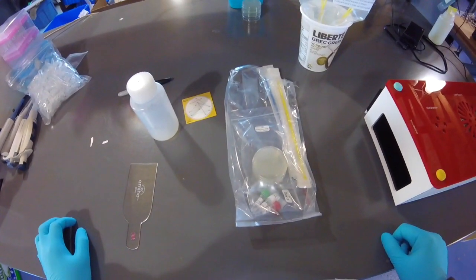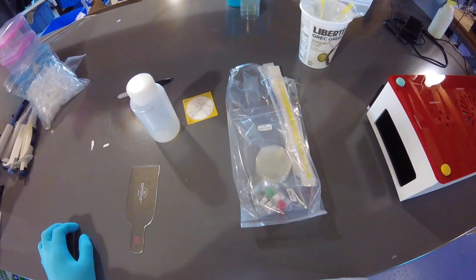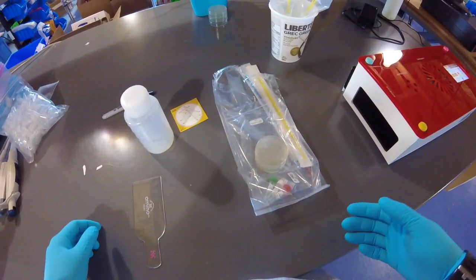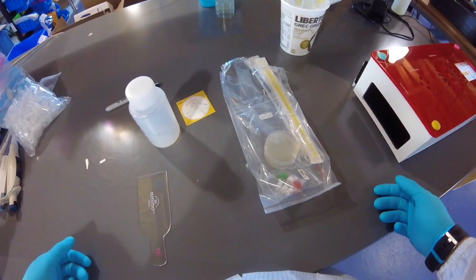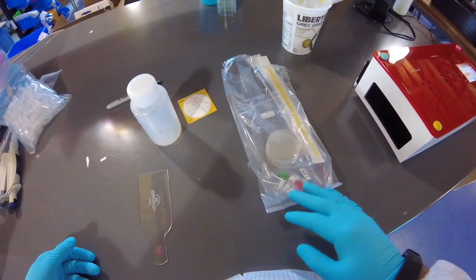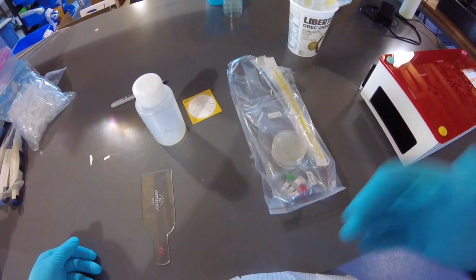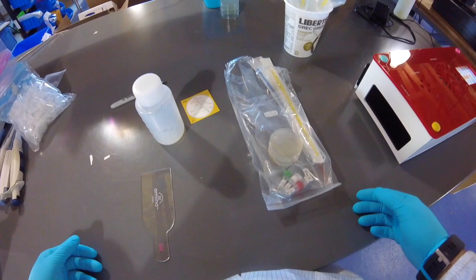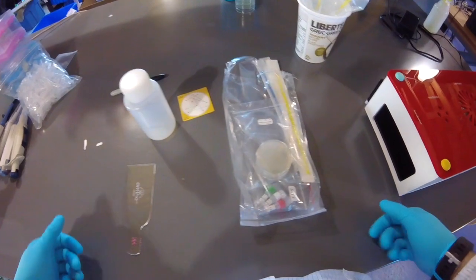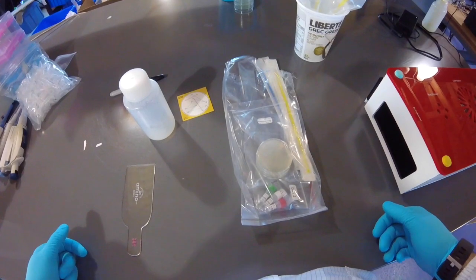Hello, we're now at day 2, and the main goal of day 2 is to do the actual transformation or genetic engineering step, where we're going to collect some of our blank cells that we streaked out yesterday, and through a little bit of temperature changes and mixing with a buffer, we'll add some DNA, and that'll get into the cells. And then by the end of today, we want to have these engineered cells being recovered so that they're starting to grow again and divide again, and so they're able to continue on with their new engineered traits.